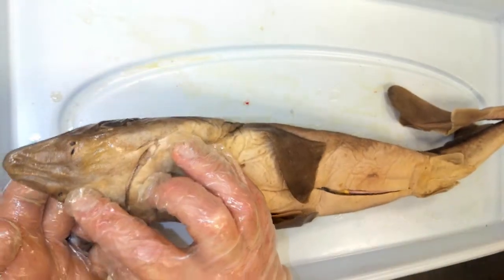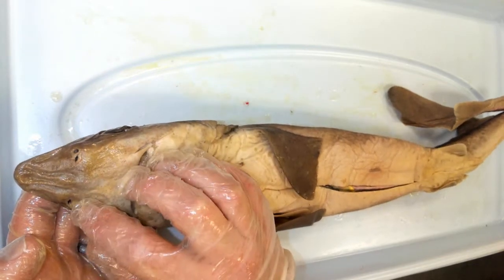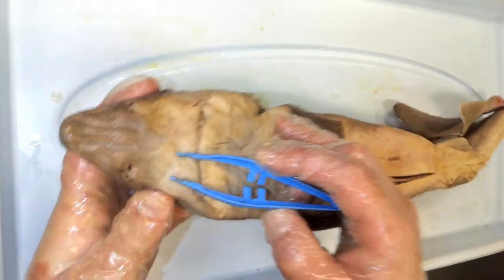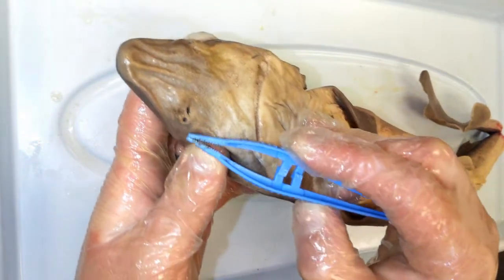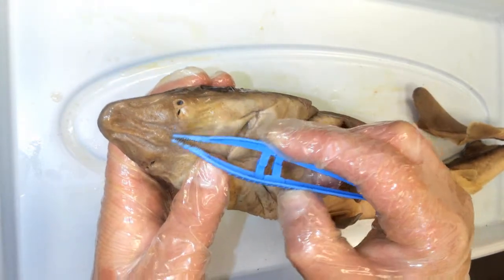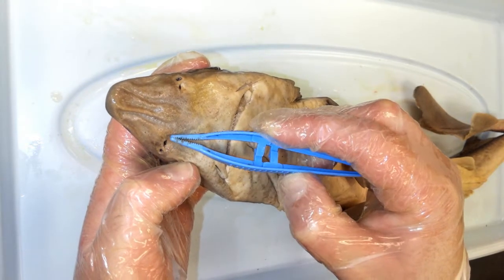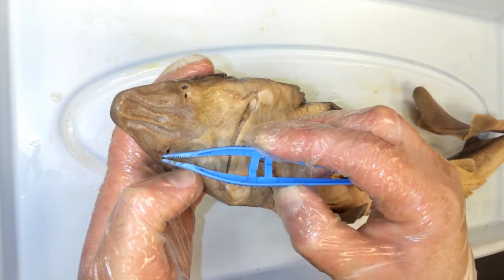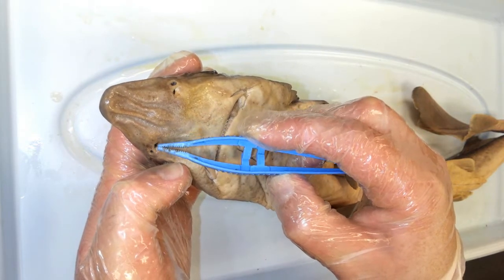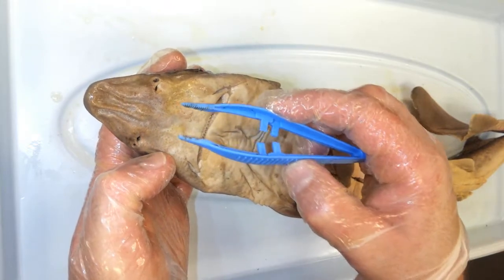On the ventral side of the rostrum we see two openings — these are its nostrils, called nares. If we look closely at each nostril, we see there are two openings: one allows water to enter and the other allows water to exit. When water enters through one opening of the nare, it flows past an olfactory bulb, which is basically an organ that allows the shark to smell chemicals in the water.